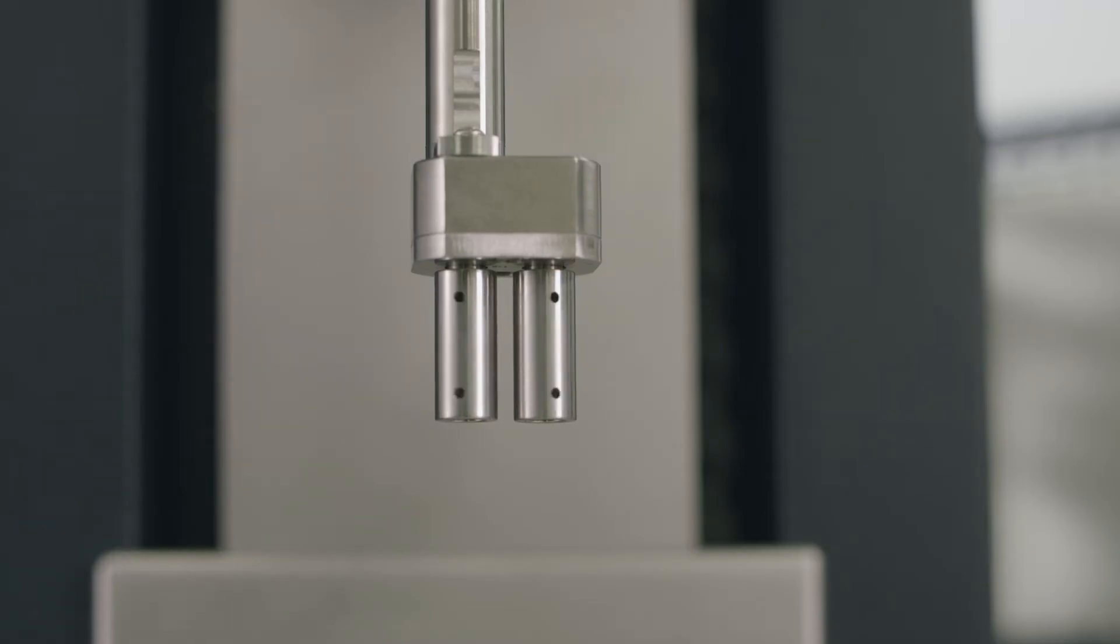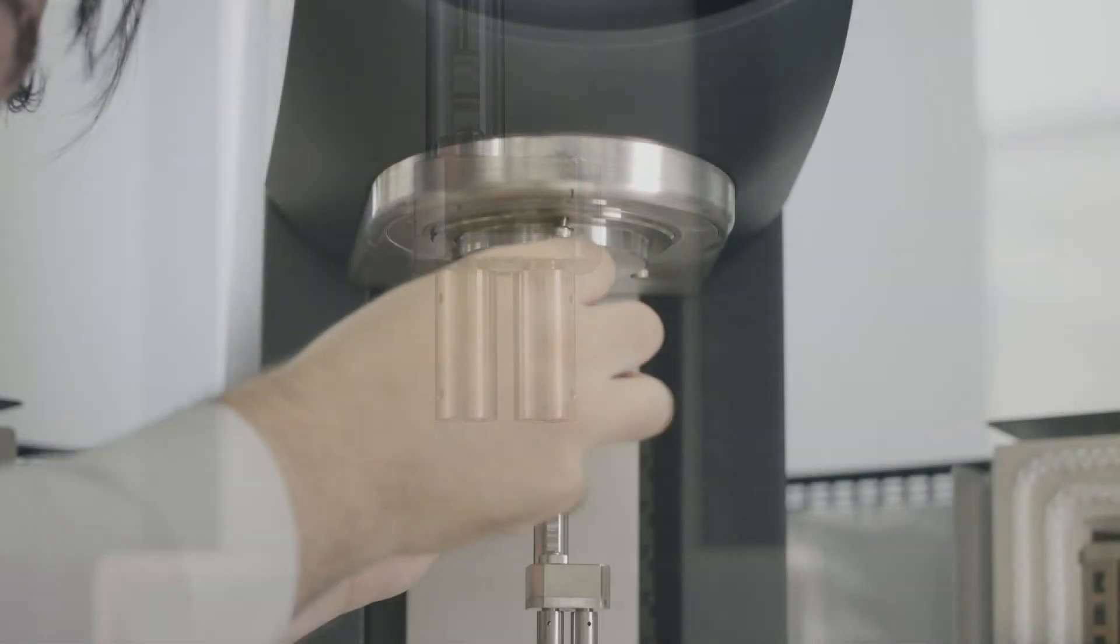Check that the sample drums spin freely when turning the shaft and that the mounting bracket sits flush against the instrument. Secure the EVA mounting bracket to the rheometer using the three screws.